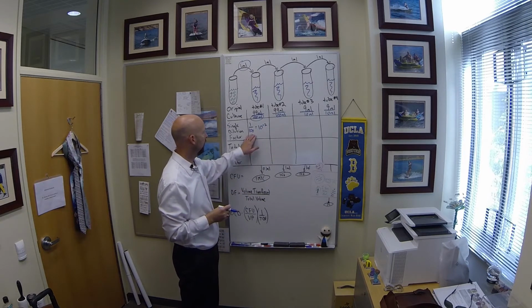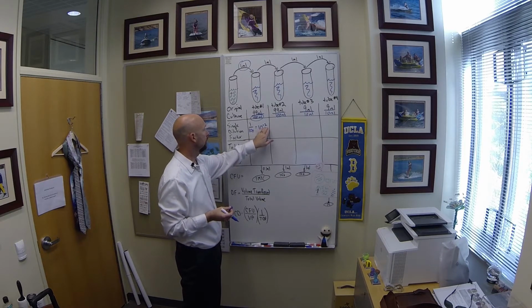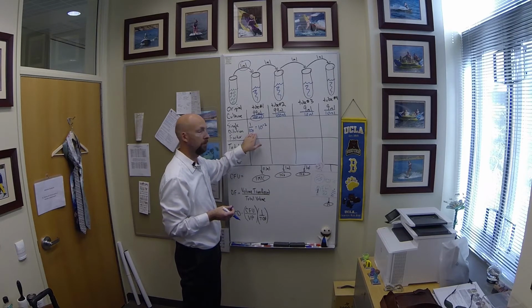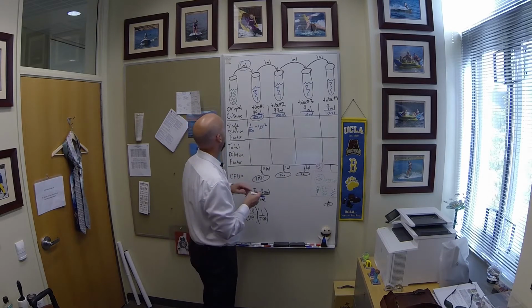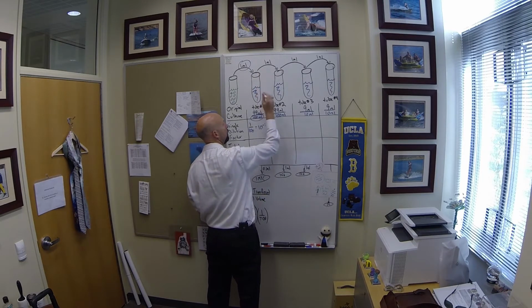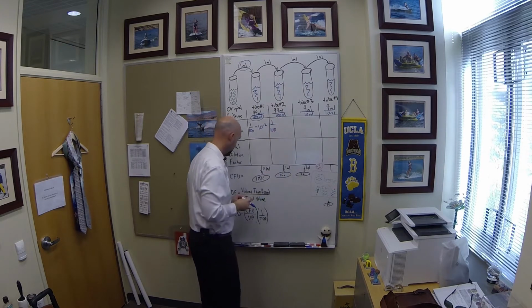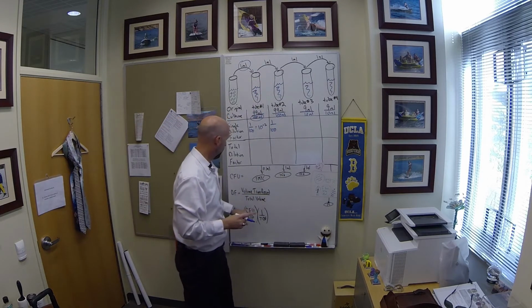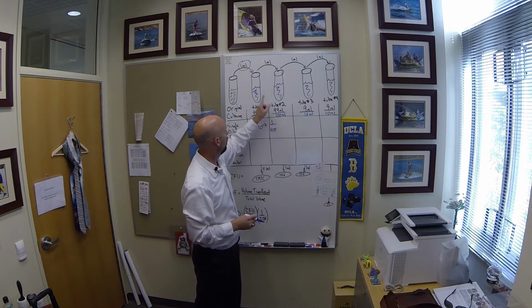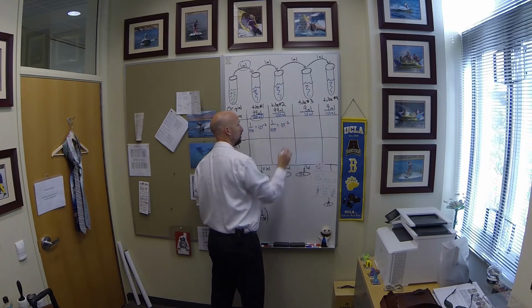An easy way to remember this is if it's got 2 zeros in the bottom, then that's minus 2. If it had 3 zeros on the bottom, so it were a 1 to 1,000 dilution, it would be 10 to the minus 3. Now what is the dilution factor from this tube to this tube? It's still 1, and the final volume is 100. Again, the dilution factor is the volume transferred, 1 mil, divided by the total volume, which is 1 plus 99 equals 100. So that's another 10 to the minus 2 dilution.